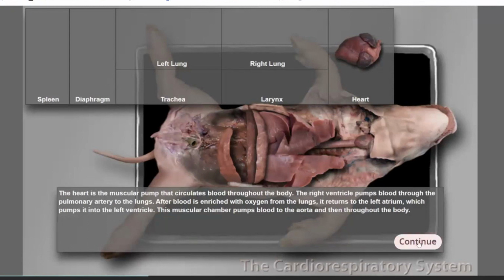If we were a red blood cell taking a journey through the heart, we would start in the right atrium. Those are the two chambers at the top of the heart that are responsible for receiving blood from the body. From the right atrium, when it contracts, blood goes to the right ventricle. At this point, blood does not have oxygen, and it needs oxygen to then be transported to tissues and deliver that oxygen.